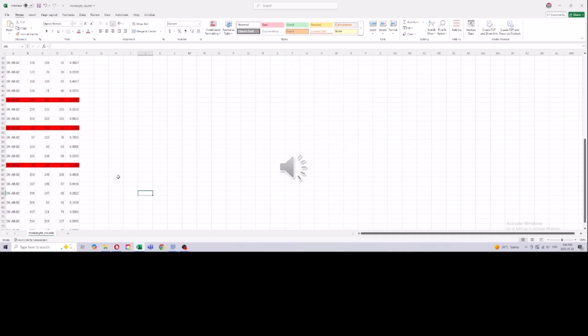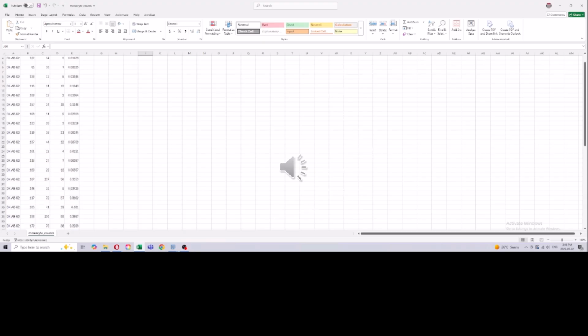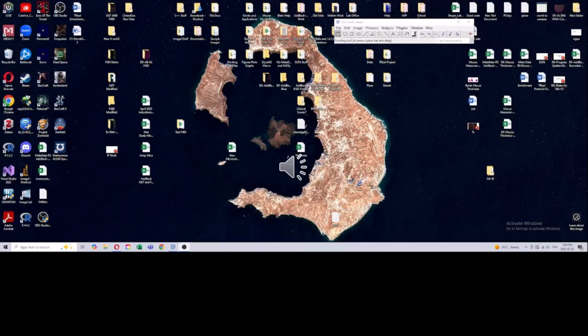So you need to go through your images and make sure you have as little background as possible, and maybe bring them into Photoshop, play around with it that way. And once they're all nice and uniform, then you can actually feed them through this. And when you're looking at it after, if you do have any of those values that are higher than 1, then you know that something's going on.